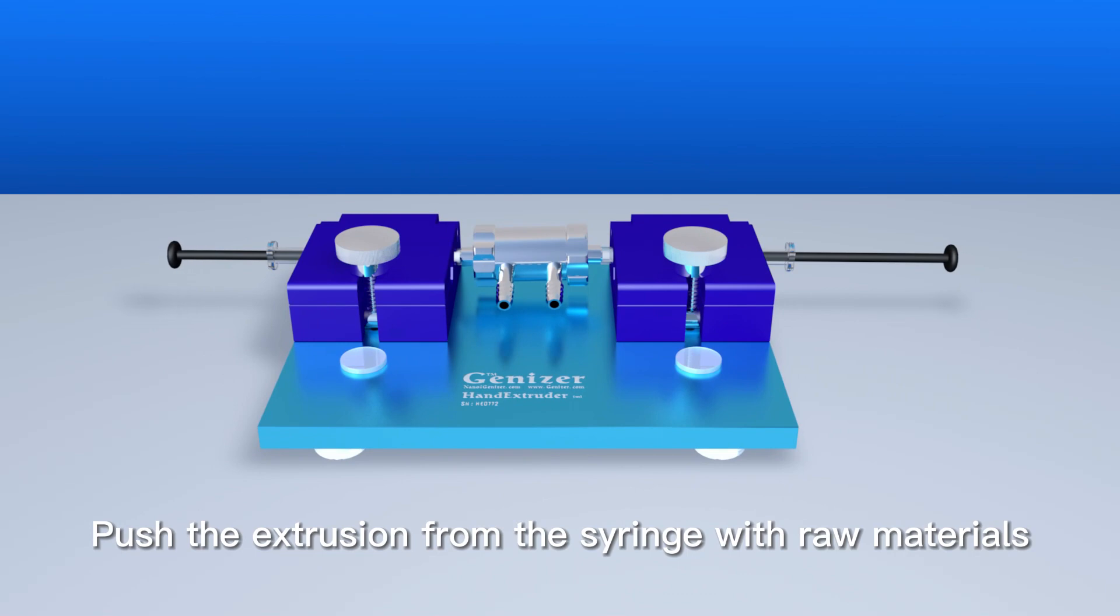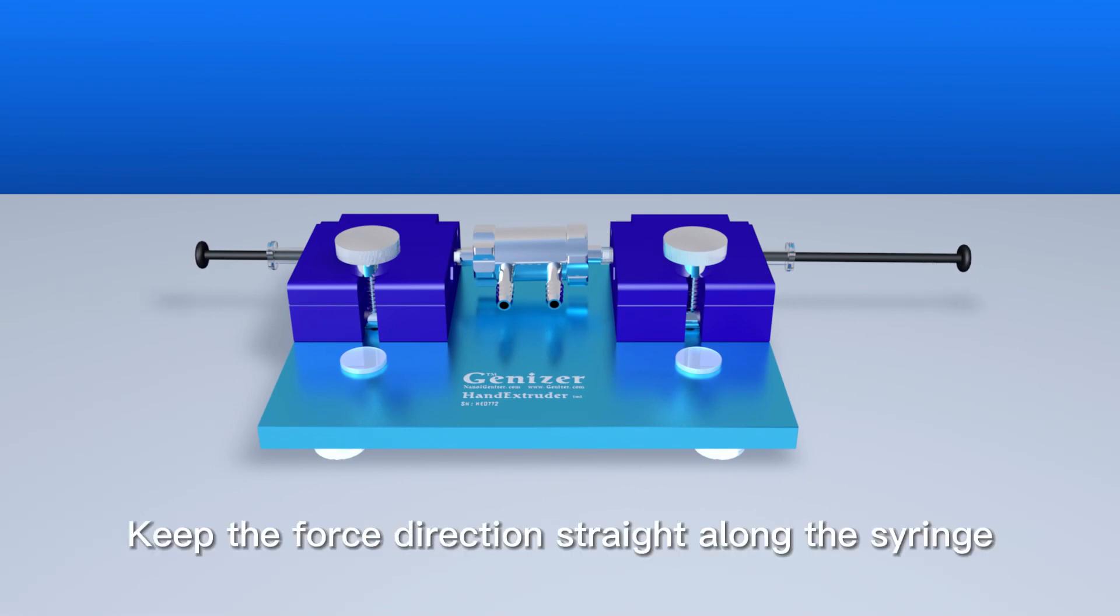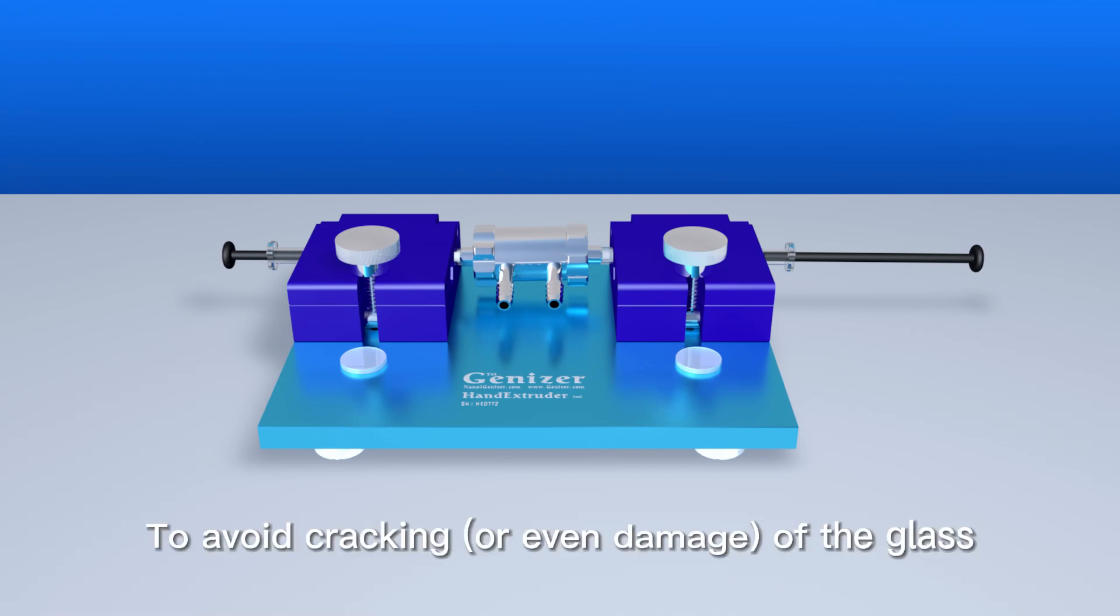Push the extrusion from the syringe with raw materials. Keep the force direction straight along the syringe to avoid cracking or even damage of the glass.